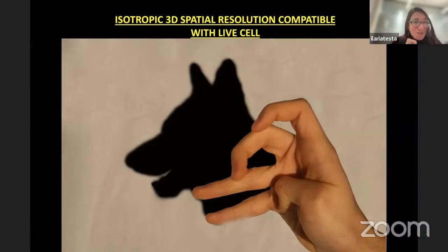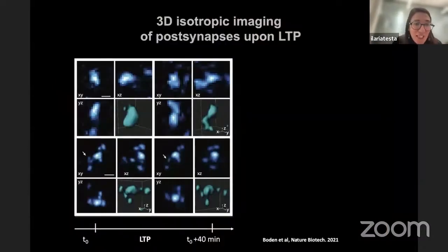To stress that, as a microscopist, I've been following the same habits of working with projection and ignoring the axial resolution, most of the time because in many systems the axial resolution is always worse. But then you have to deal with the fact that mistakes can be made. Maybe not as big as this one, where you can mistake a hand for a wolf, or the other way around. But yes, this mistake can be made.